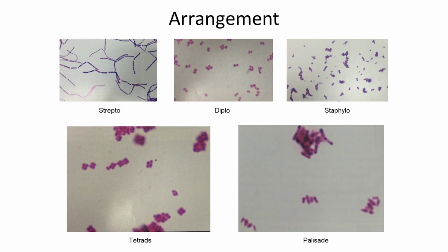These are palisade bacteria. They line up long ways along here. You can see the example here and here. But they also like to stack on top of each other like you just dumped a big pile of logs on top of each other. So they tend to have a lot of 3-dimensionality as well. So you kind of have to keep an eye out for that one because it gets a little confusing, and you can see them stacked kind of all on top of each other.